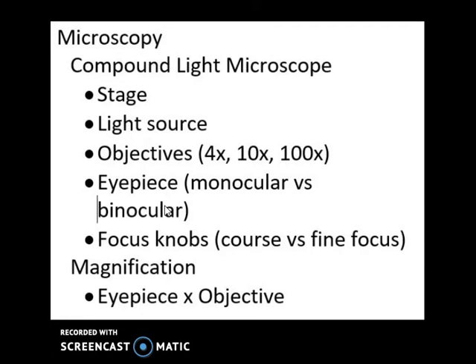Make sure you're fiddling around with your adjustment knobs to get things into focus. An important terminology you will have to know is parfocal. It just means that you can look at something under, say, 40 times the magnification, switch to the 10x objective, and things will still be in focus, which is cool.